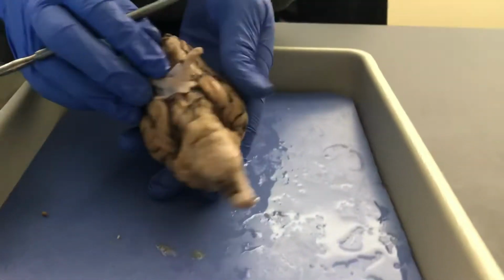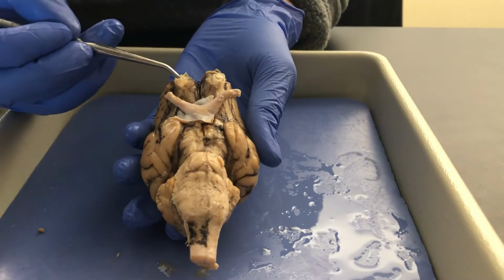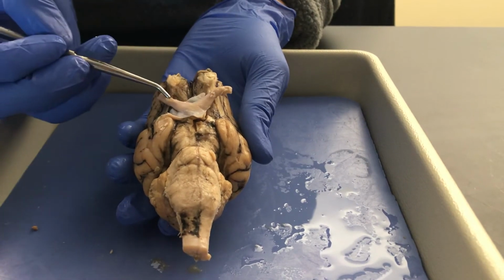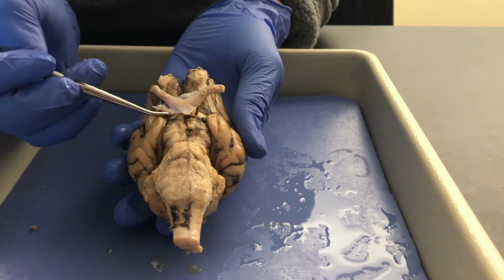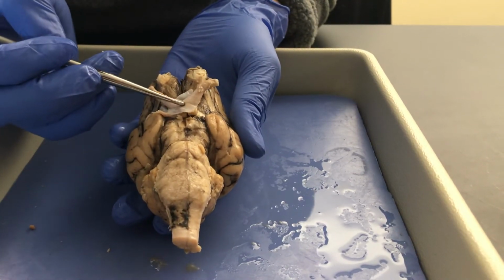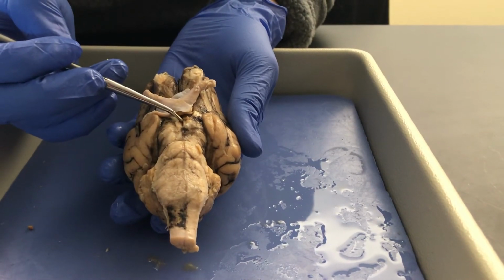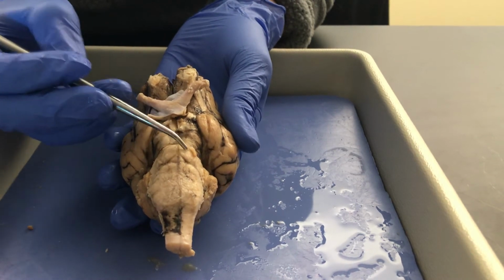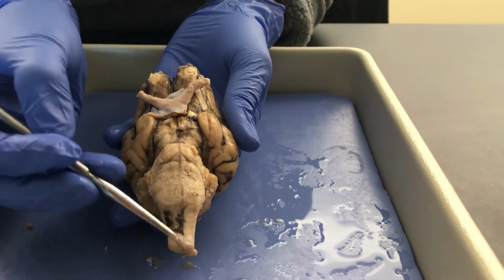For this view, for the lateral, or the ventral view, you'll see the olfactory bulb, optic nerve, optic chiasm is where they crisscross. This is part of the dura mater. Then below the optic chiasm, you'll see the mammillary body. Then we'll see the pons, medulla oblongata, and the spinal cord.